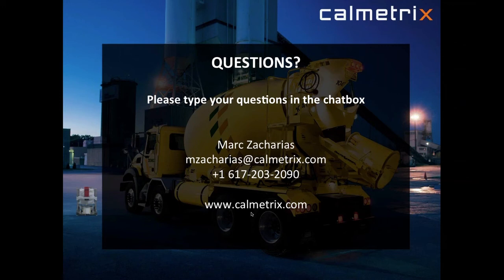Great. Good question, Bruce. Yeah, it is definitely not a portable unit. It's not something where you could, on a routine basis, move it from location to location because of the weight.